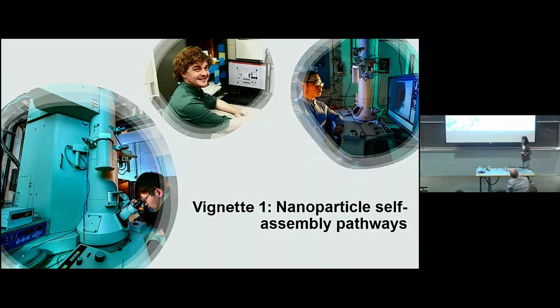Many different aspects, machine learning is very important. And then we also will have students like Zihao who will sit in front of the electron microscope, enjoying his time capturing movies in situ, actually doing some in situ control of the solution during the self-assembly process. We will also have students like Chang showing here, who will spend hours and hours in front of the electron microscope, utilizing the most current beam technology to make sure we get what we want to get.